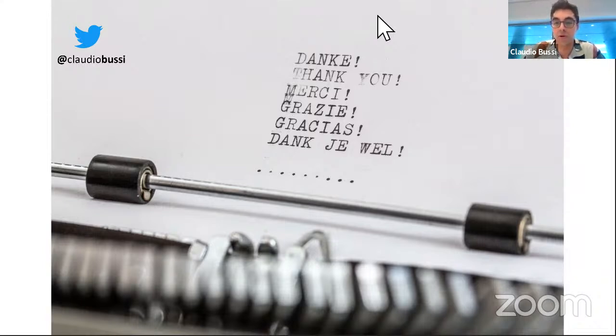De hecho, cuando nosotros hicimos el curso, hicimos una práctica; es una metodología que está disponible. Luego, antes de venir a realizar acá el postdoc, yo estuve en contacto con la gente del Centro de Microscopía Electrónica de la Facultad de Ciencias Médicas, en la UNC, y ellos también estaban intentando ponerlo en funcionamiento. En Tucumán también sé que estaban intentando hacerlo. Básicamente, si uno tiene el microscopio electrónico, es posible.